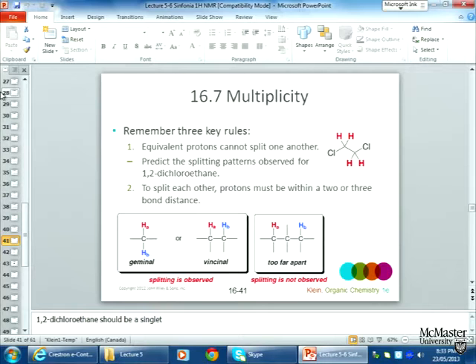That is possibly largely fortuitous, but it's extremely useful. Because if every hydrogen in a very complicated organic molecule coupled to every other one, everything would be a nightmare, right? The technique would be useless. The fact that you can tell in coupling patterns simply about the number of hydrogens on the neighbor next door is extremely useful.